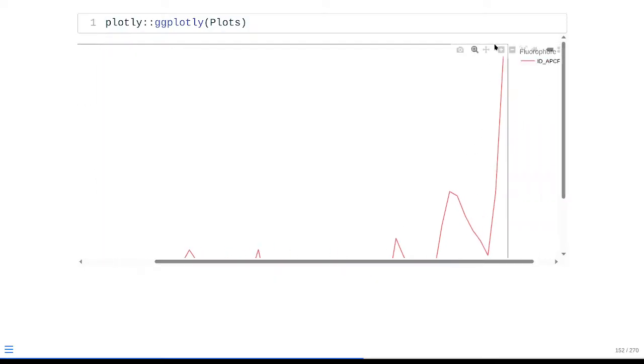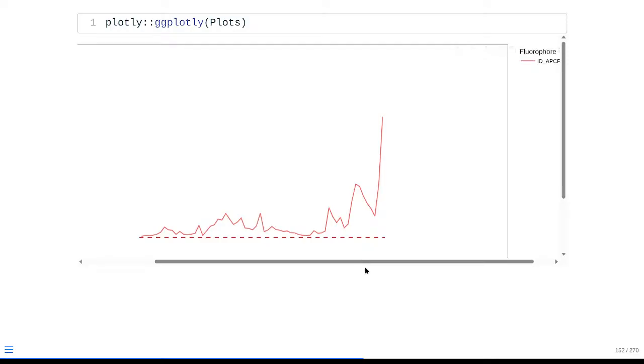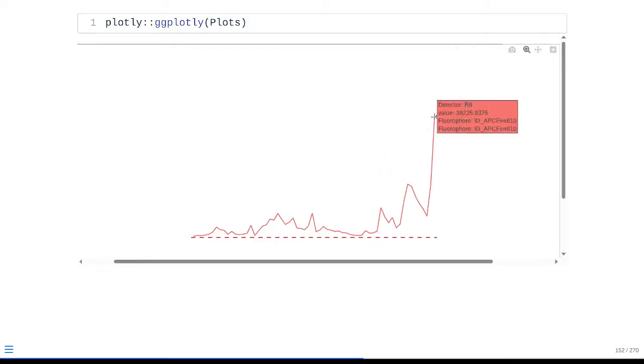And if I zoom out so that you can view it on the screen, we can see this is the raw value that we just extracted from our single color control. We can see the R8 detector is currently at 38,225 in terms of its median value. R1 is showing up at 16,804. YG4 is 9,418, and then Violet 7, which typically is autofluorescence, is showing up as 7,568.